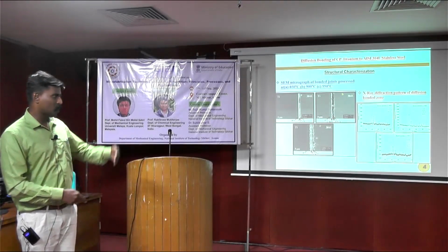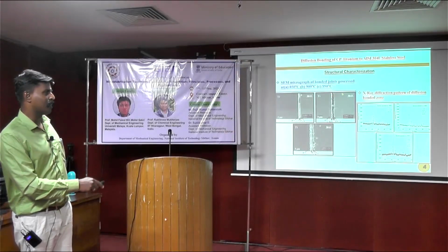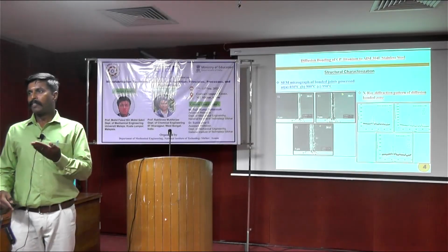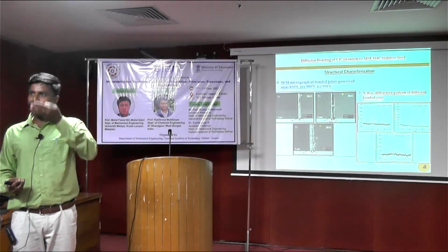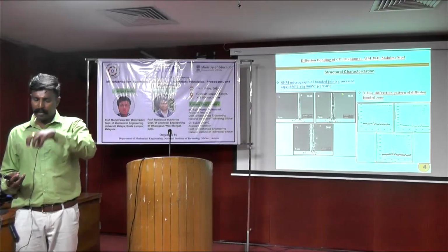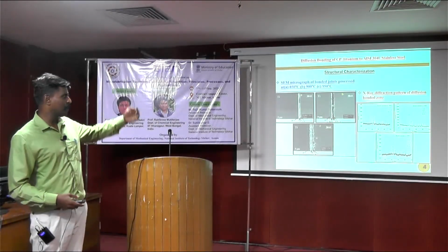You can see this is a cross-sectional view of the bonded surfaces. It is clear the joints are intact, but there is some layer-by-layer evolution, and we are keen to study that. This is from SEM characterization, scanning electron microscopy, where there are electron-particle interactions. Several signals come out, such as characteristic X-rays, backscattered electrons and transmitted electrons, but SEM is mainly focused on collecting secondary electron signals, which frame the image.